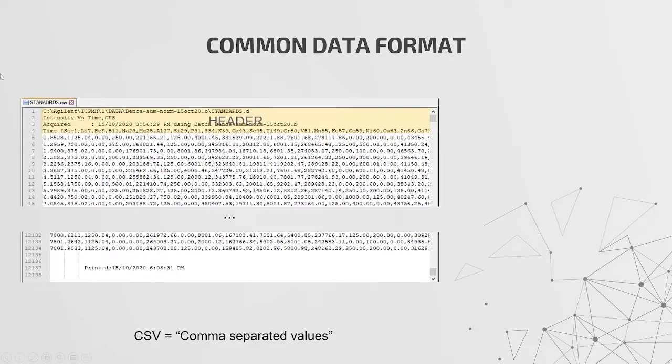There's the header, or the header information, the header lines as we sometimes call it. And this is metadata. This is data about our data. We also have the main data, which you can see here, which is the actual values that were measured. And we have the footer. Not all files have a footer, just like not all files have a header, but sometimes they do, and it's just some blank lines at the end. Sometimes it's a statement like this, when it was actually printed, that type of thing, and we'll need to account for those in our import process so that our importer doesn't try to treat this like data.